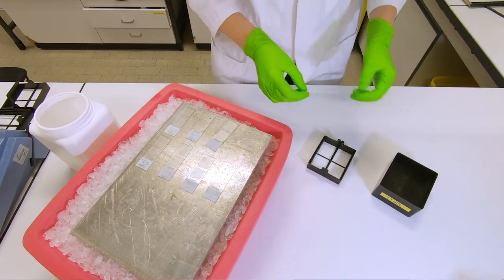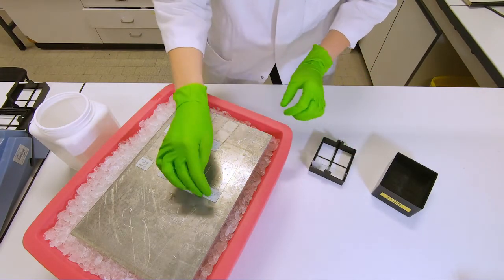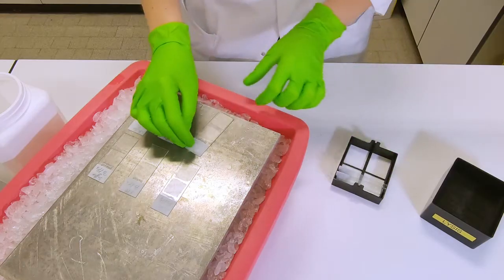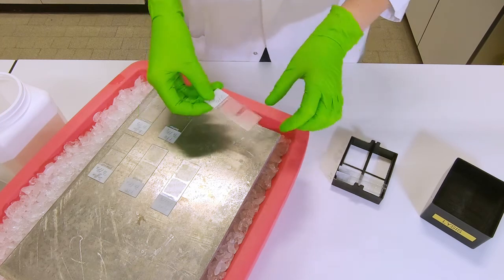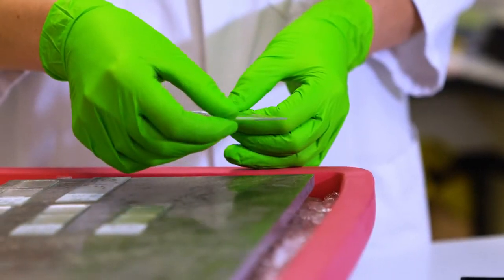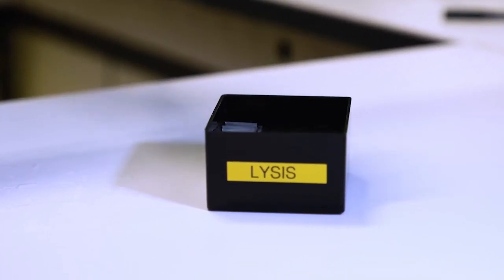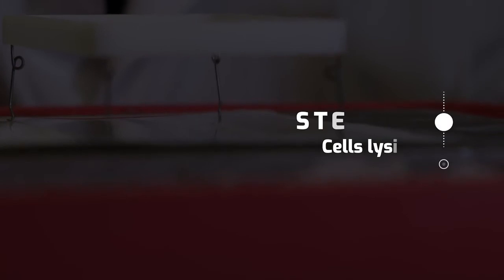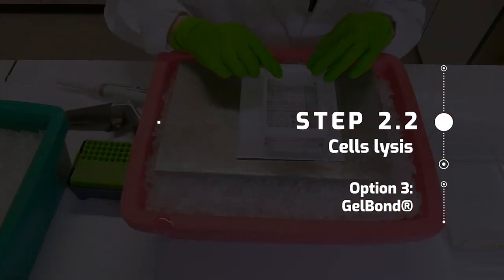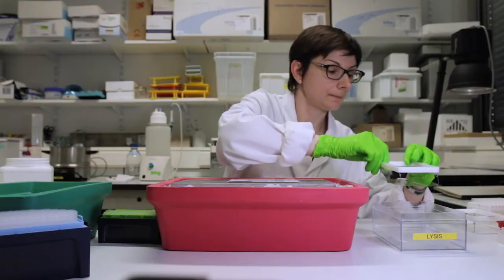After about 2-3 minutes on the metal cold plate, transfer the slides containing the 12 mini gels to the lysis solution. In the case of the slides containing the 2 big gels, remove the cover slip and transfer them to lysis. Whenever the gels on the gel bond film are ready, the gel bond film is transferred to the lysis solution.